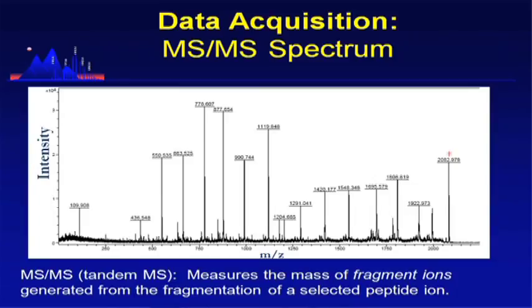If you remember, I had a starred peptide. I didn't point it out when I showed you the mass spectrum. In that spectrum, all of the peaks were different peptides. In this spectrum, we've told that quadrupole in our front end to isolate one peptide out of everything that's there. So we set the filter to say, there are all these molecules here, but I only want to look at this one. So filter for this peptide, and allow it to go into that collision cell.